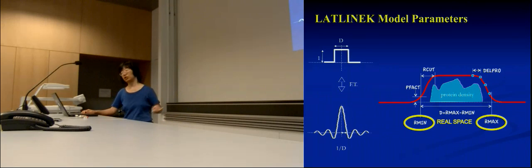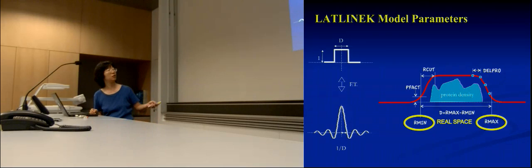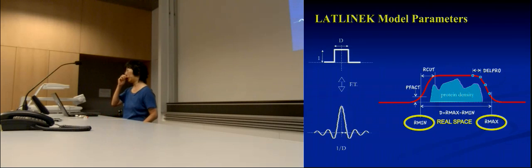This envelope function obviously has to be about the size of your protein density. It needs to be able to cover your density well, because if it's too small, you're cutting off your original periodic thing. It creates extra bits of it. So that's very important, to make it about the size of what you expect it to be.